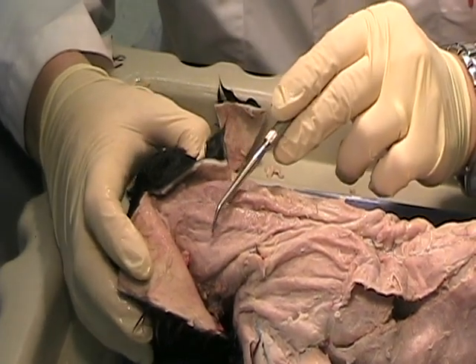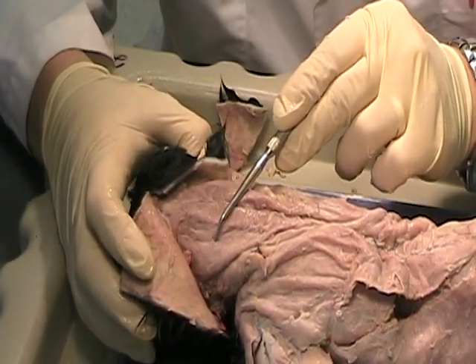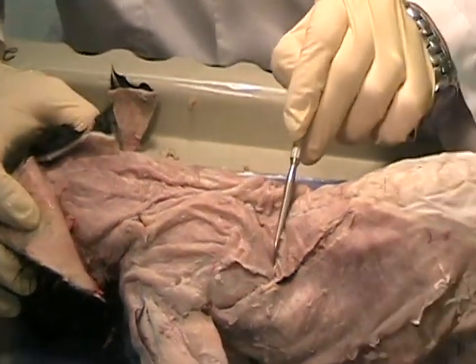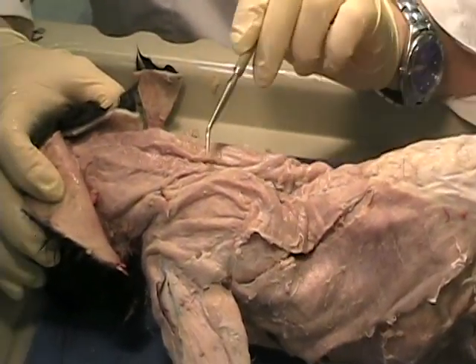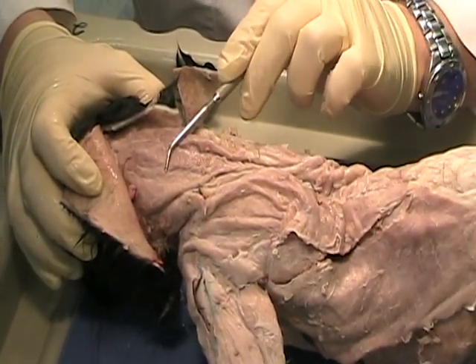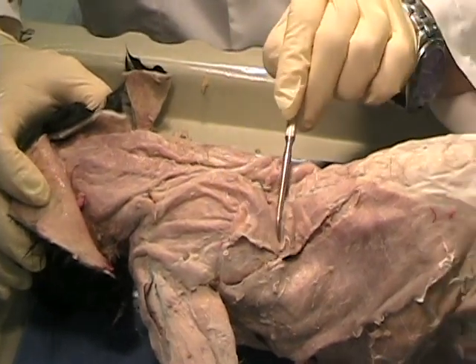The trapezius is three parts. It's got what's called the clavotrapezius, the acromiotrapezius, and the spinotrapezius. These are all one muscle in the human body, but in the cat it's made of three separate muscles. So: clavotrapezius, acromiotrapezius, spinotrapezius.